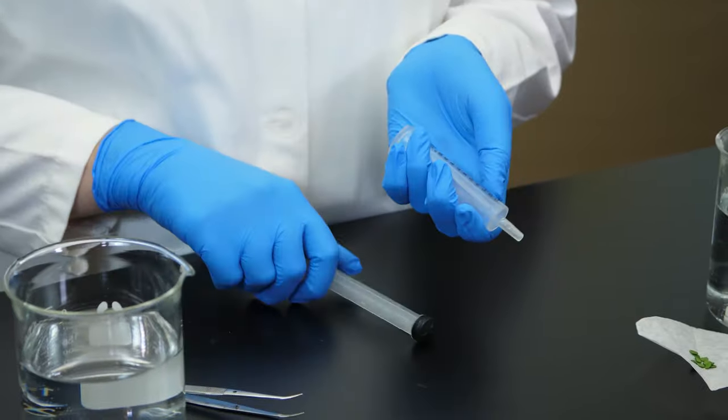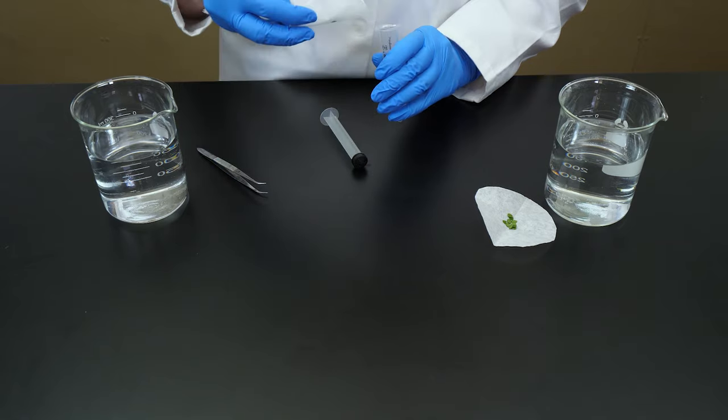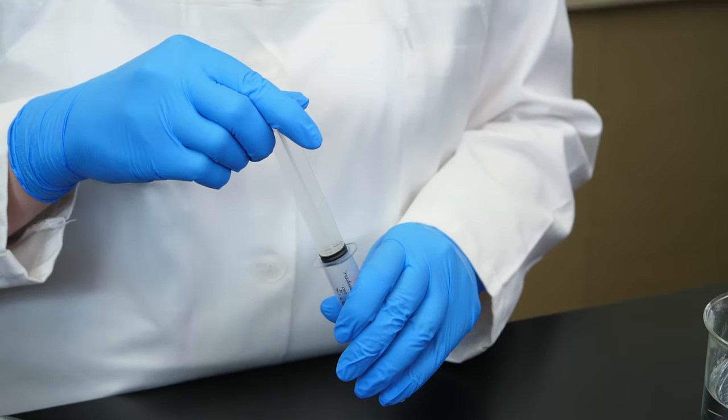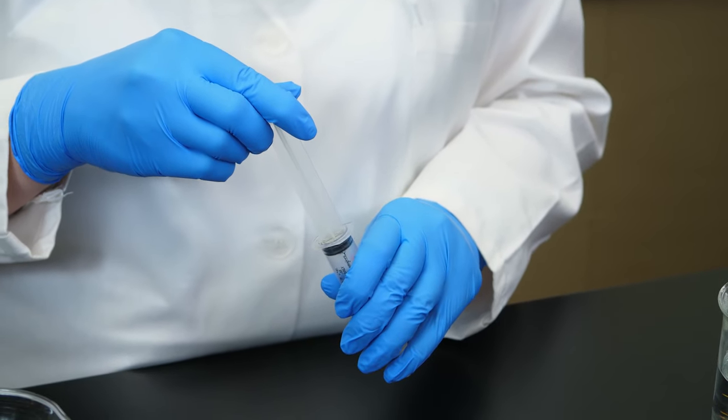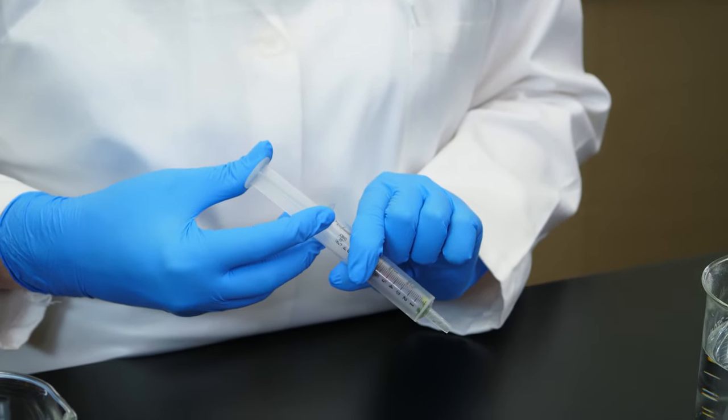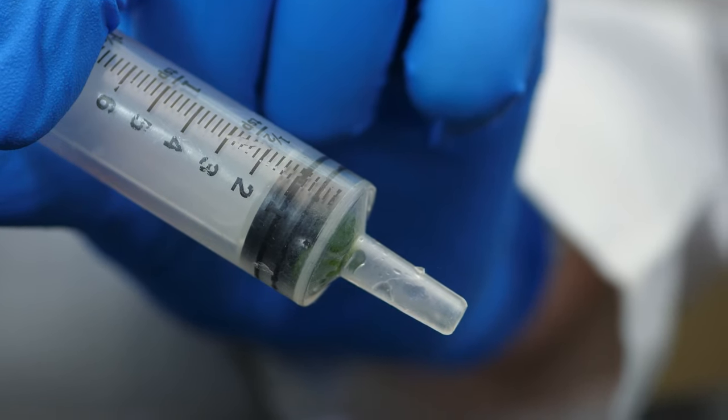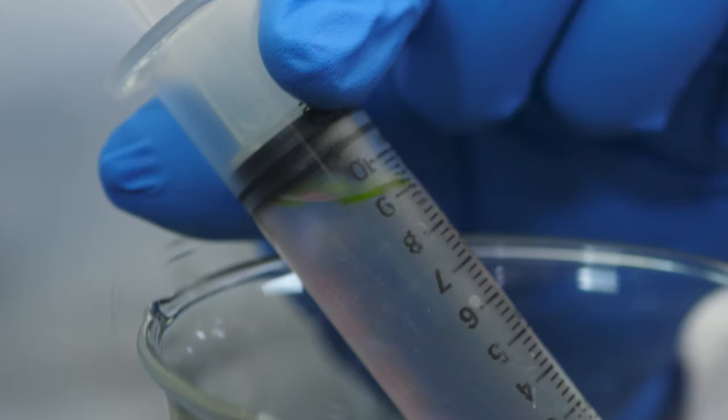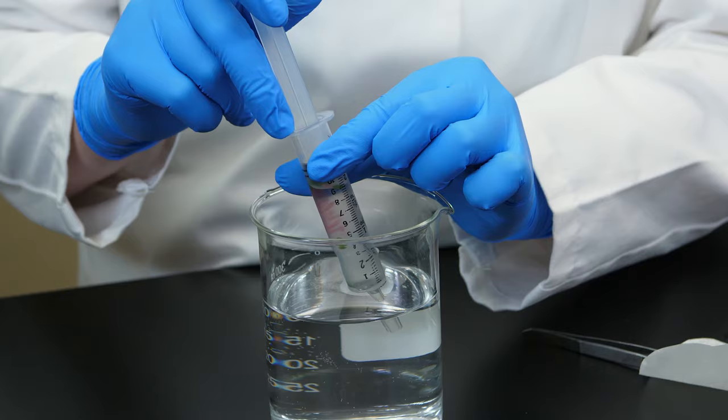Now, we will remove the plunger from a syringe and dump 10 chads into the barrel. Next, we insert the plunger and force as much air as possible out of the syringe by depressing the plunger almost to the bottom of the barrel. We need to draw 10 milliliters of the sodium bicarbonate solution into the syringe from one of the beakers.